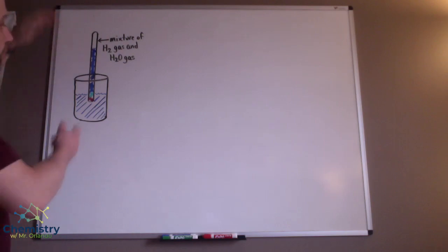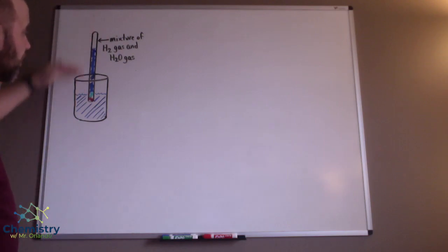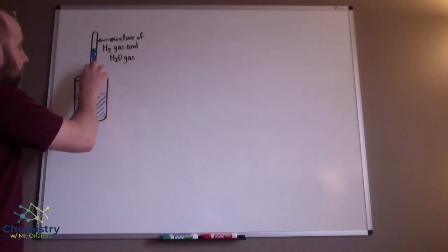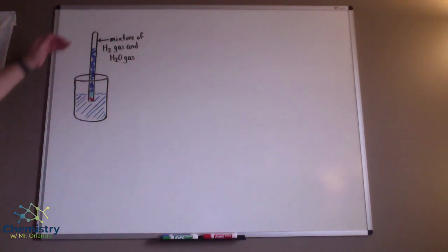So when you flip over your tube and the hydrochloric acid, which was at this end of the tube, goes down to the bottom, it starts reacting with the magnesium down here and generates hydrogen gas bubbles. So you might see bubbles going up the tube if we were doing this in class. And eventually there would be enough bubbles that the entire water level at the top of the tube begins to go down.